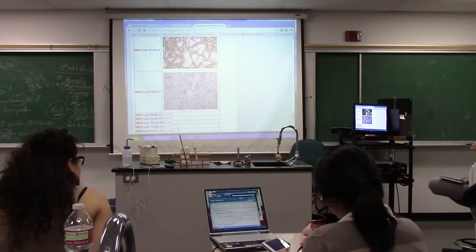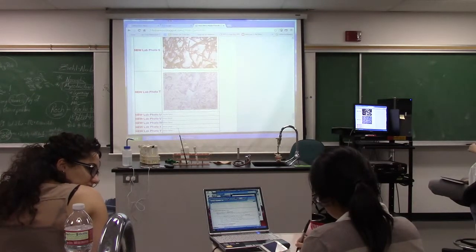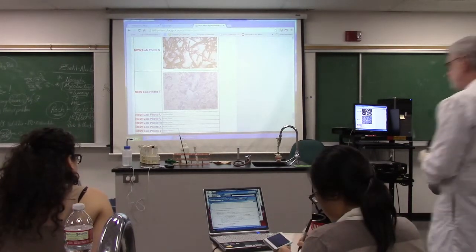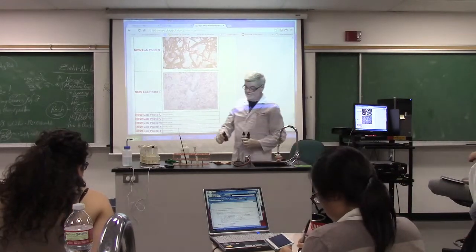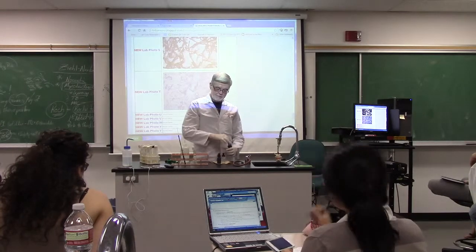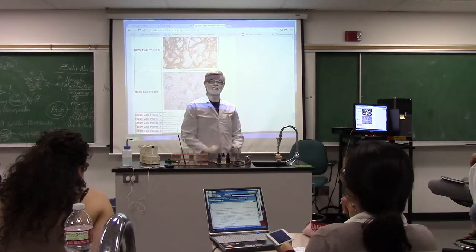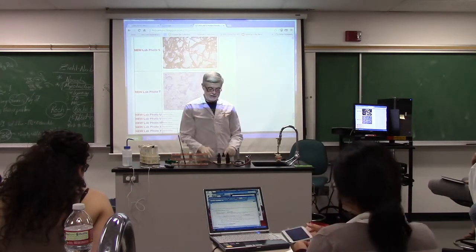I know this may be very hard for you, but you have to share the stain bottles. It may hurt, but you'll be okay. Another fun thing about this one is please keep the stain bottles on a piece of paper towel because they dribble everywhere. Don't pick up by the cap because they deteriorate.